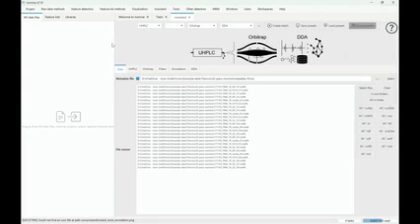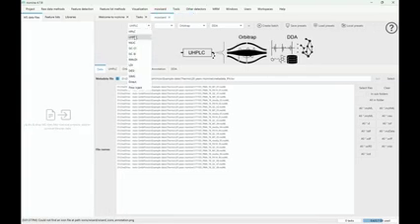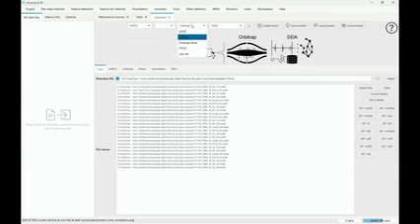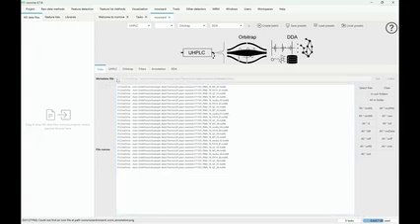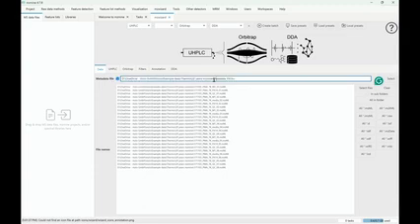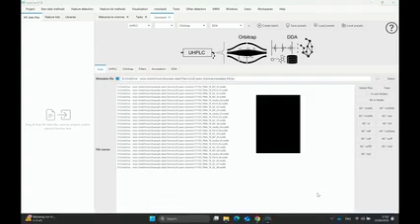So from here, the first thing is we have to select the files. First of all, you have to select here UHPLC and Orbitrap. And then in data, there is the metadata file. So you have to check the metadata file. And then here, we have to find this file that we shared with you in the data folder. If it is zipped, I have to disable some things here.